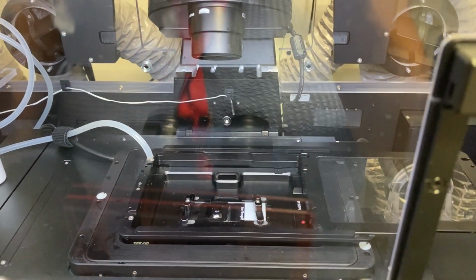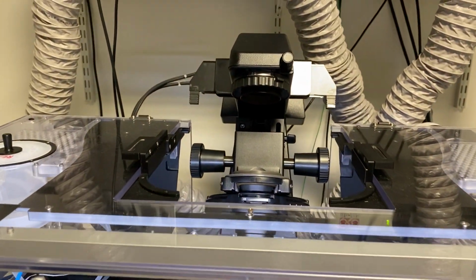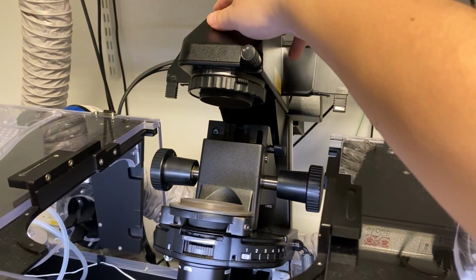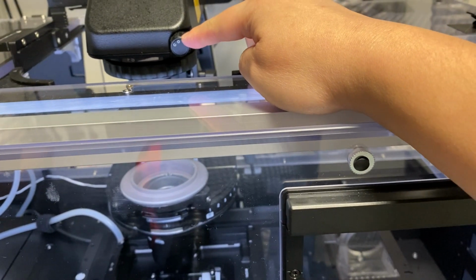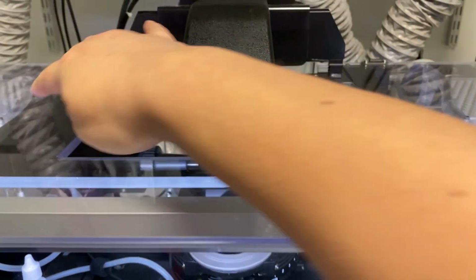Next, we are going to focus on the sample. Unless you are using bright field, this can be left in the pushback position. But if you are using bright field, please make sure this is down, this is open, and you can close these.